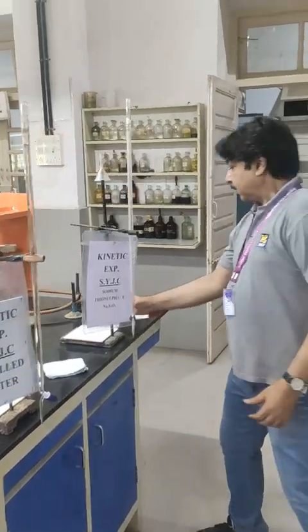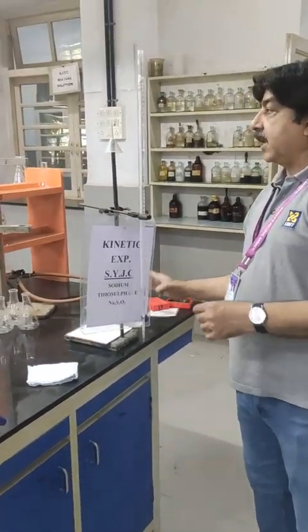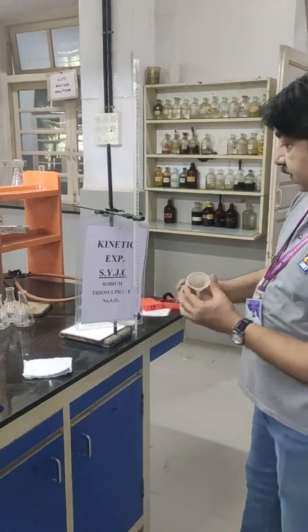And the last burette will be filled with sodium thiosulfate.